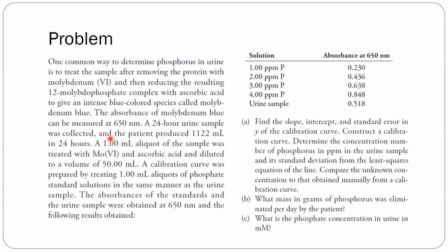Okay? Or 1 ml representative. And you treat it with the molybdenum complex nga na kanina para maging absorbent siya ng UV-vis radiation. Okay? So 1 ml representative sample from the 1.122 liters. After you perform the complexation, idadilute mo siya ngayon to a final volume of 50 ml.